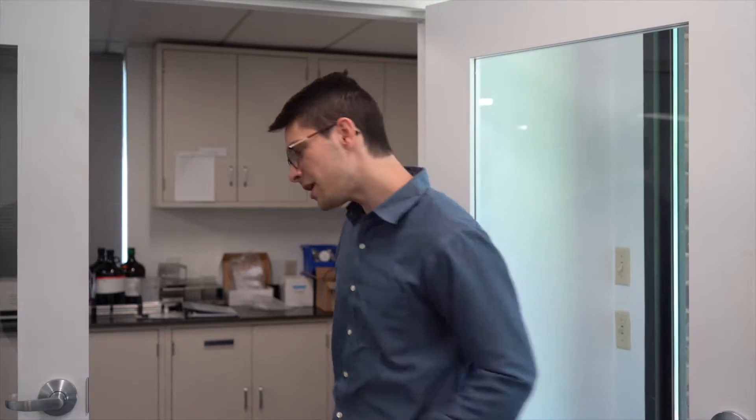My name is Ben Sigmund and I'm an evaporation product specialist here at Buki. Today I want to talk to you about our Rotavapor R300, but first I want to show off our state-of-the-art demonstration lab. Come on in!